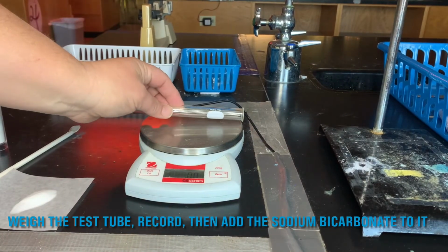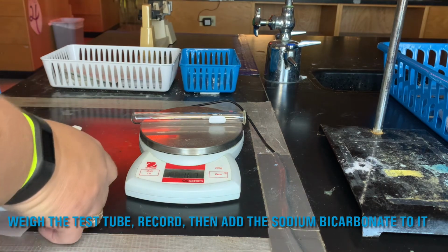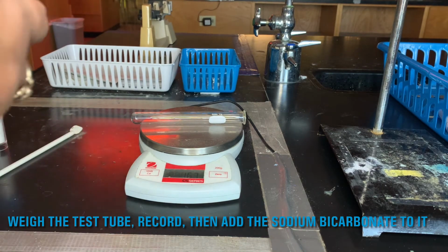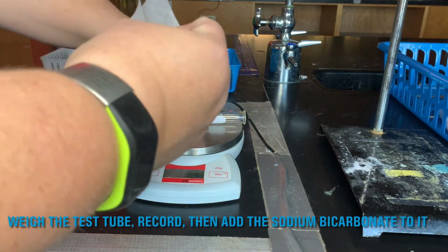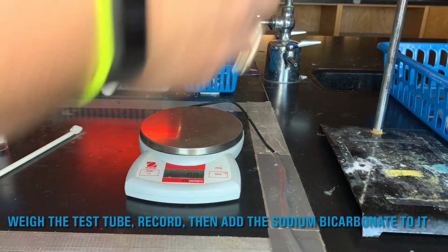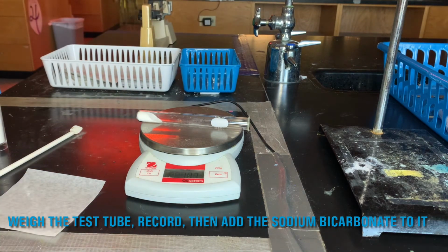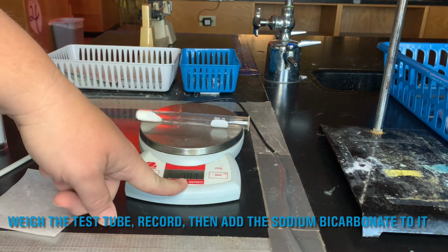So I'd recommend weighing and recording the mass of your test tube. Okay. Then we're going to place our solid in the test tube. I'm going to weigh it, and it should be the two masses put together. And we're going to record our measurement onto our table.